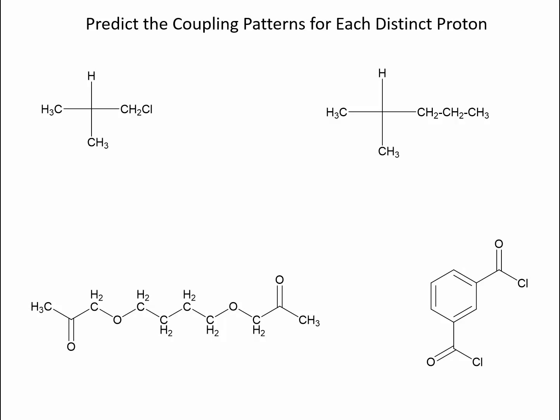All right, so let's do an exercise here again. You should do this yourself. Pause the video, do it, and then come back and see the answers. We're going to predict the coupling patterns for each distinct proton in each of these 4 molecules.